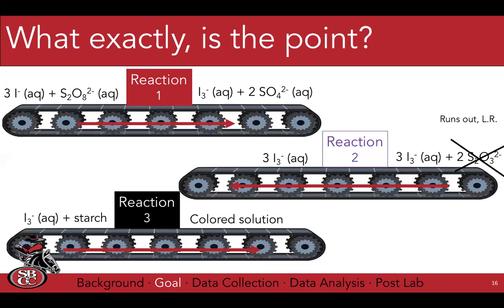Really good question. The truth is they're all going to happen simultaneously, and that's the challenge that we have in understanding these reactions, is that it's all going to be one vessel, and reaction 1 will go, reaction 2 will go till it runs out, and then reaction 3 will start. And we're going to mix all of the reagents together and then time it.